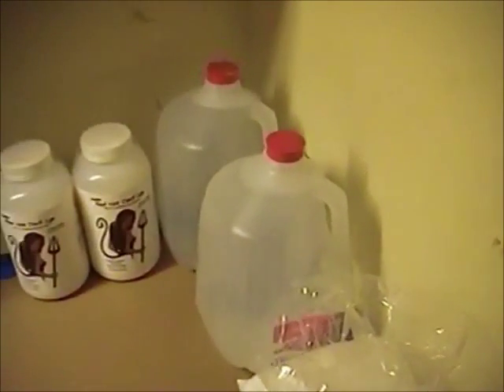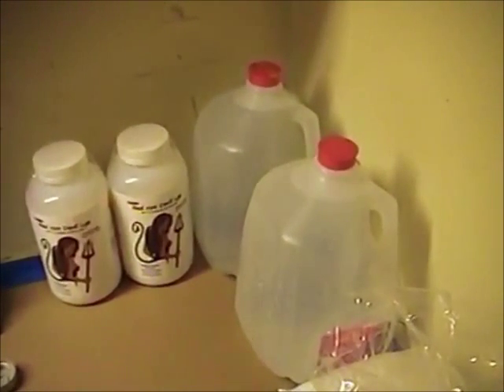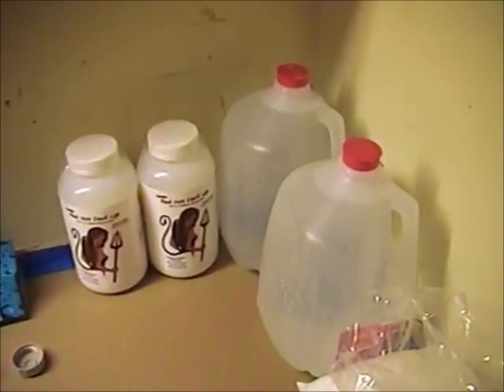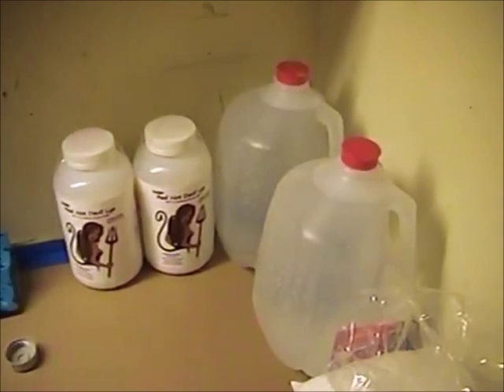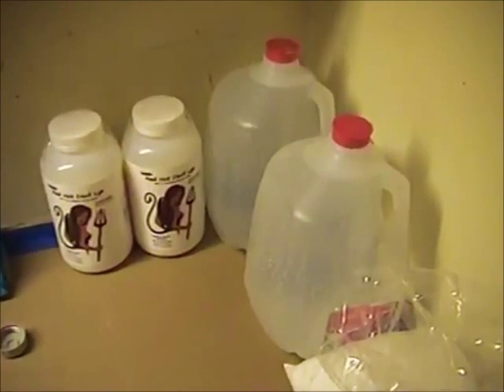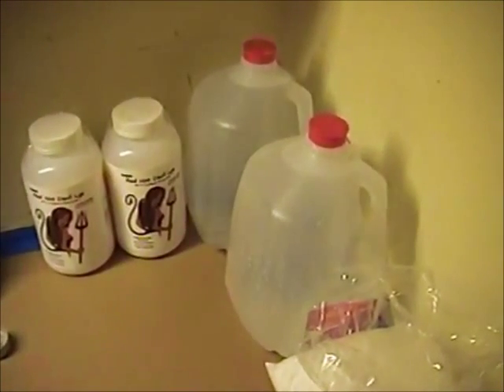Behind that I have a couple gallons of distilled water. You can pick these up at Walmart, CVS, anywhere like that for about 80 cents to a dollar a gallon. Always use distilled water. If you use tap water or put any chlorides into this experiment we're going to complicate things a little bit and lose some of our silver.